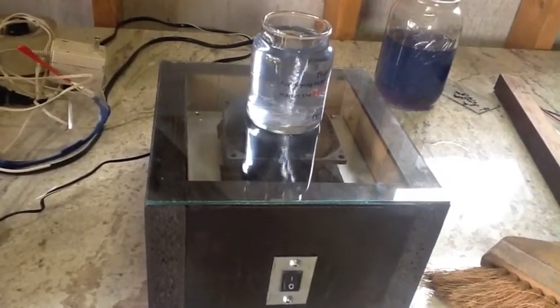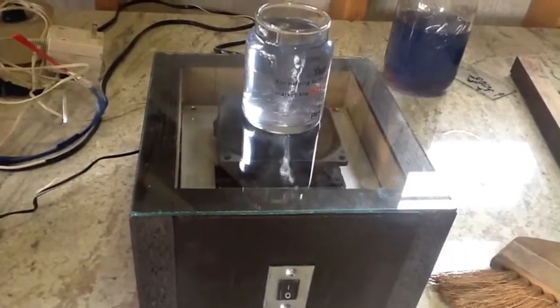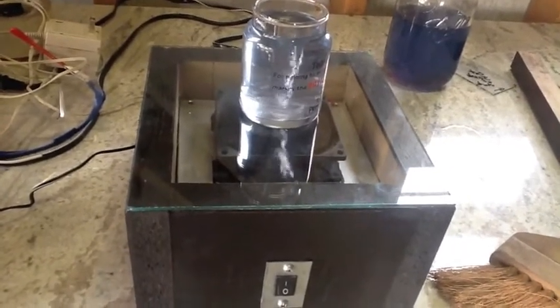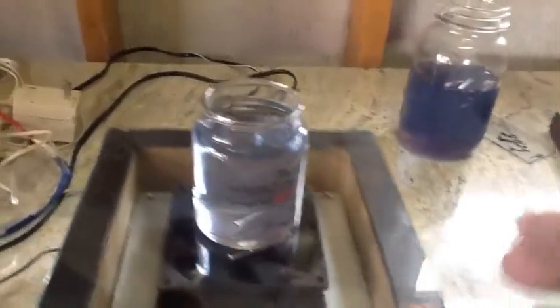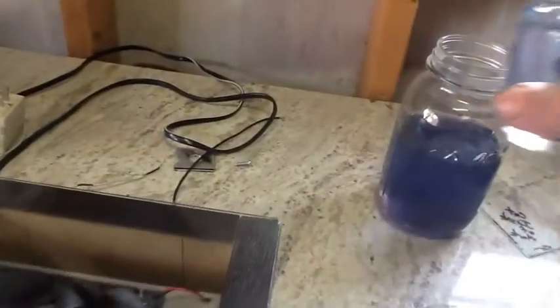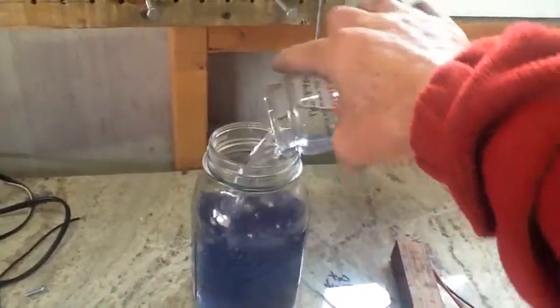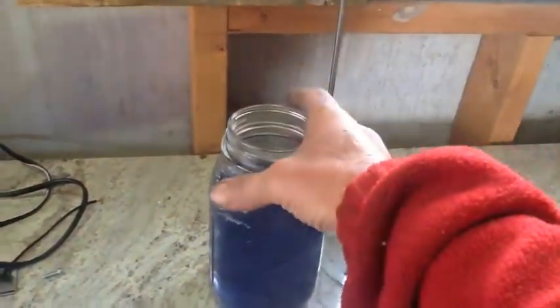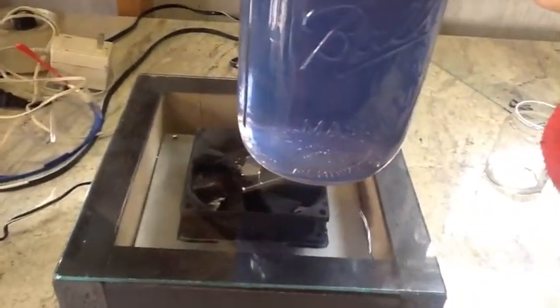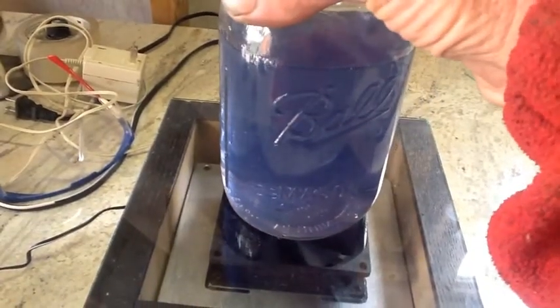I can see already this thing's going to be a pain — I'm going to have to clean this glass all the time. Let me go ahead and shut this off. I'll dump that over in here and let's try the big vessel out. Hopefully it doesn't break my glass. Bear with me while I align this stir bar. Turn it on.